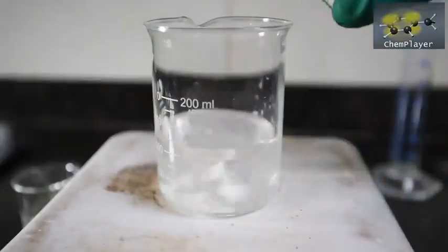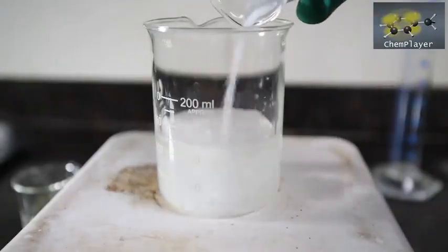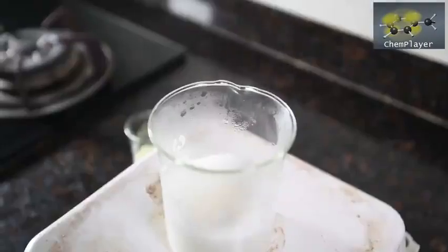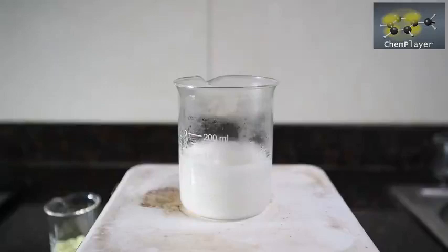Now we add the sodium hydroxide, which should form our sodium sulfite. The sodium hydroxide dissolves and you can see the mixture getting pretty hot as it does so and reacts to form the salt. The sodium sulfite is less soluble, so we've got some white colored solid now suspended in the mixture.